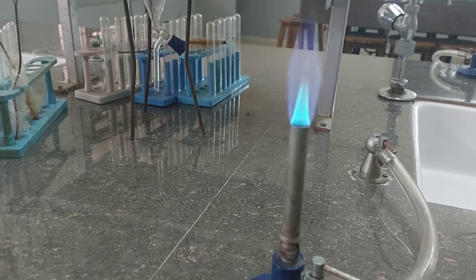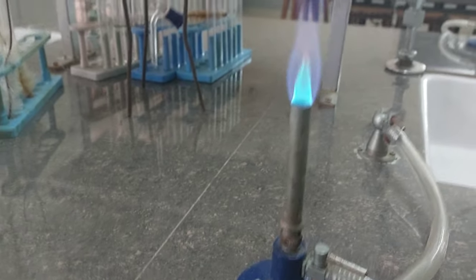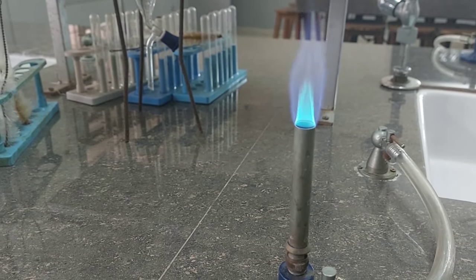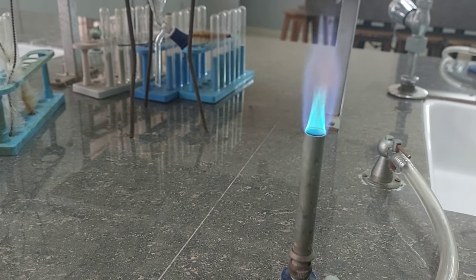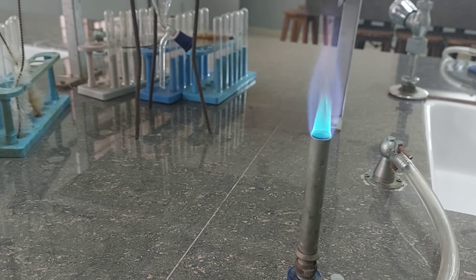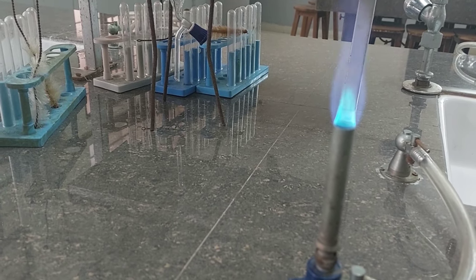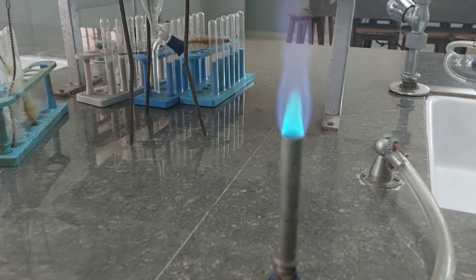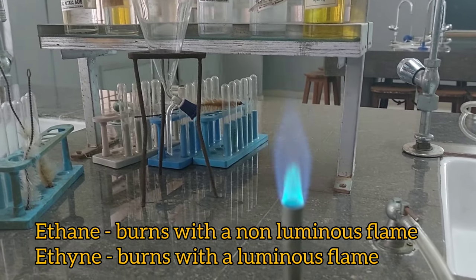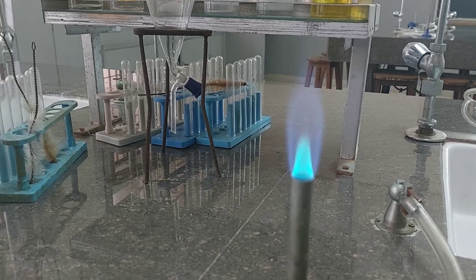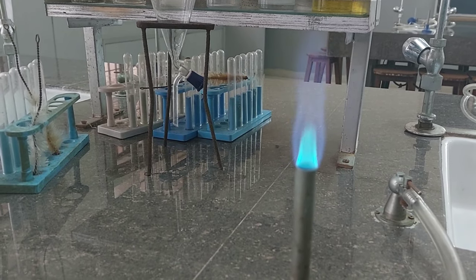The luminous or the yellow flame corresponds to unburnt carbon. So if we compare the fuels, say alkynes, alkenes, and alkanes, alkynes have a high percentage of carbon. C2H2, more percentage of carbon than hydrogen, in comparison to ethane, ethane C2H6, more hydrogen for the same carbons. So ethane burns with a non-luminous flame whereas ethyne burns with a luminous flame which we also call as a sooty flame.